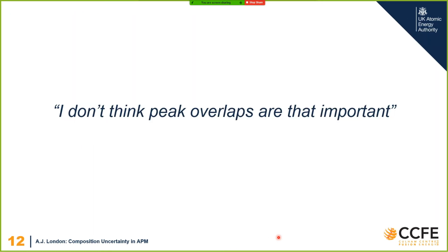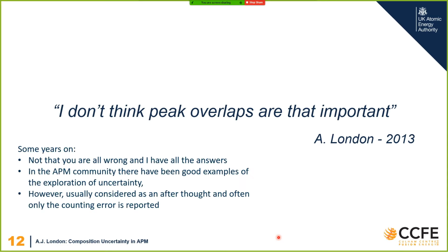So someone once said, "I don't think peak overlaps are that important," and that person was me, circa 2013. And this was in response to a presentation that I gave in the Oxford Materials Department. And yes, I was asked, have you considered the effect of peak overlaps in your data? And I was like, no, they're not that important. They were important, actually.